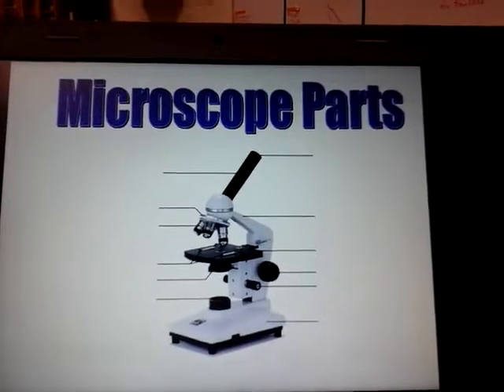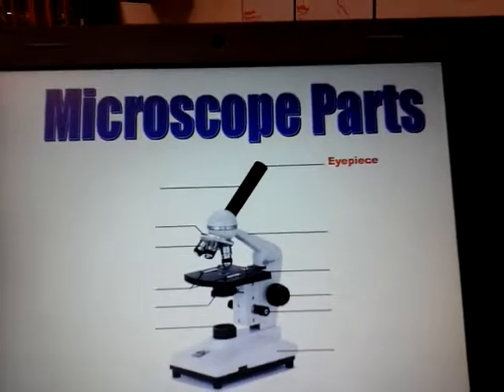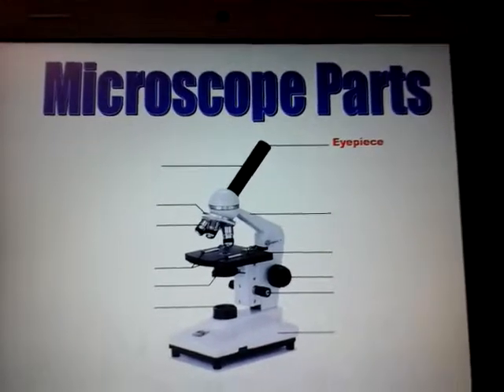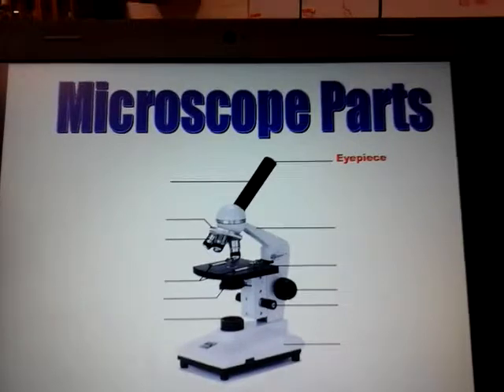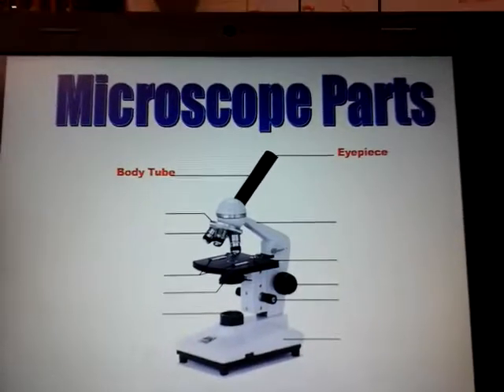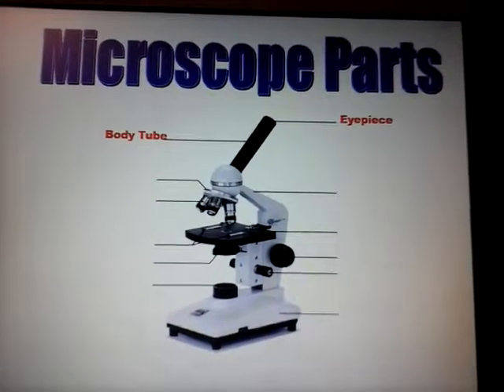Now, in the case of the microscope, like we said, we've already labeled what you have on the back, and this diagram has more parts than what's labeled on your page. But we've already labeled letter B. Letter B is what's called the eyepiece. And like I said, the eyepiece has a lens in it by itself that allows us to magnify things 10 times. Now you don't have this line on your drawing, but please add it. It's called the body tube.